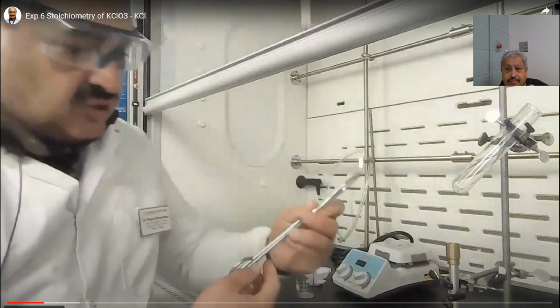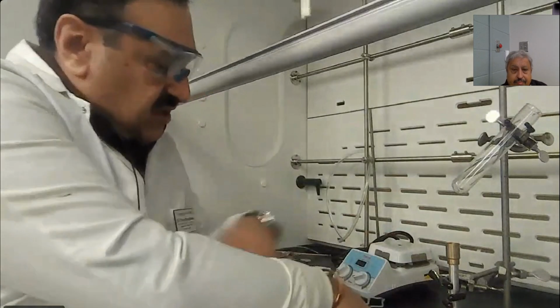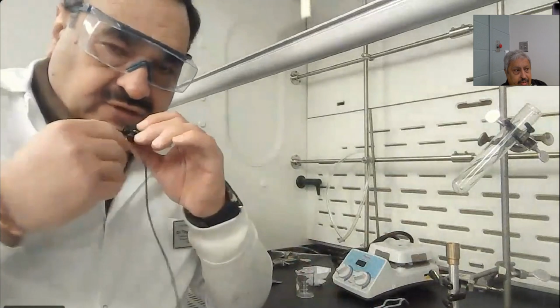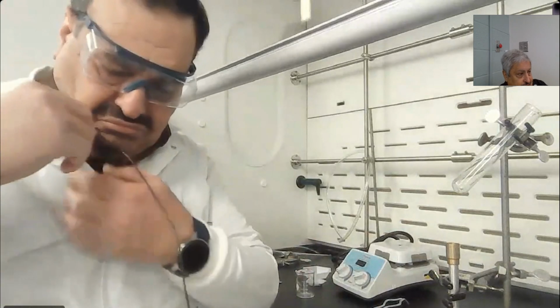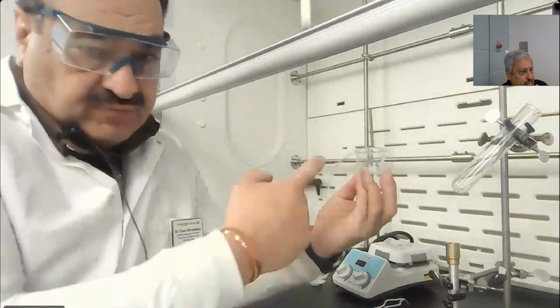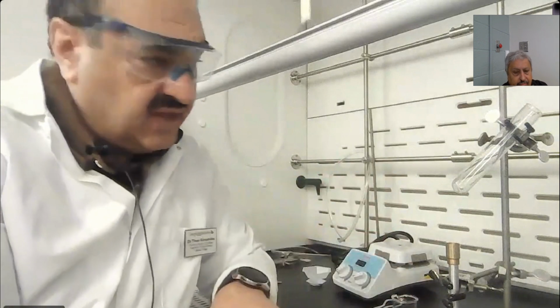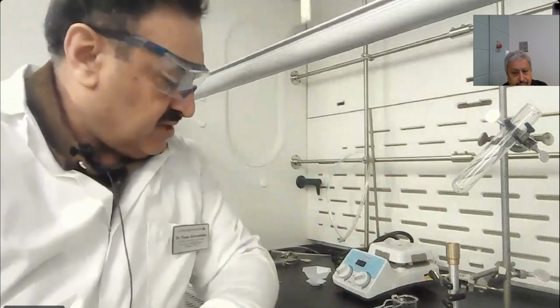We use this clamp to hold the test tube, and we have to take the weight of the test tube by using the small beaker. I will make some modifications. I will let you know after the recording is done. Put the test tube inside the beaker, straighten it up, so the test tube is not tilting or falling inside the beaker on the balance. Try to take the mass of the empty test tube after it's cooled down.